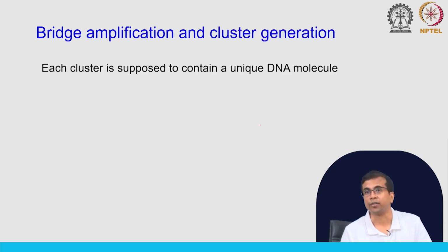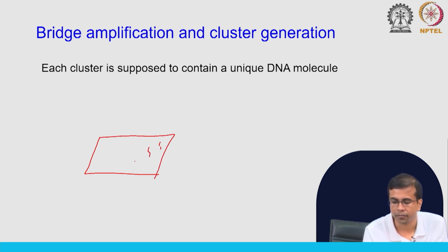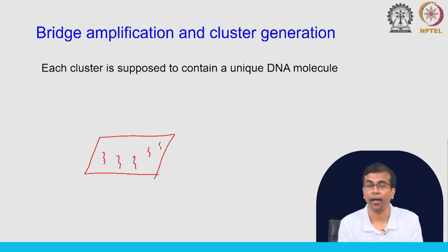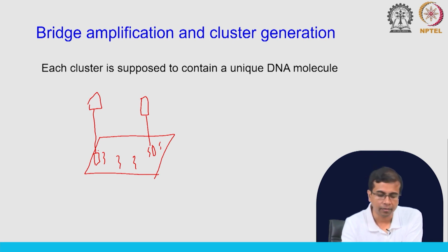So, let us look at this, right. So, what happens inside this flow cell, you can imagine, is you again have some DNA molecules that are complementary to these adapter sequences. Okay. So, like 454, you have certain sequences, DNA probes that are complementary to adapters. So, what happens now is that this DNA molecule with adapters will come and hybridize, right. Now, this means you can generate or amplify these fragments, okay, using DNA polymerase.